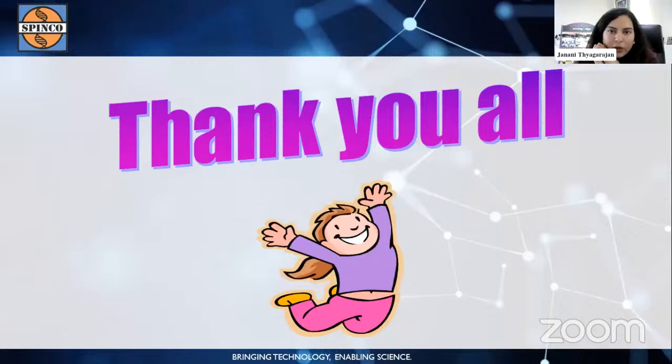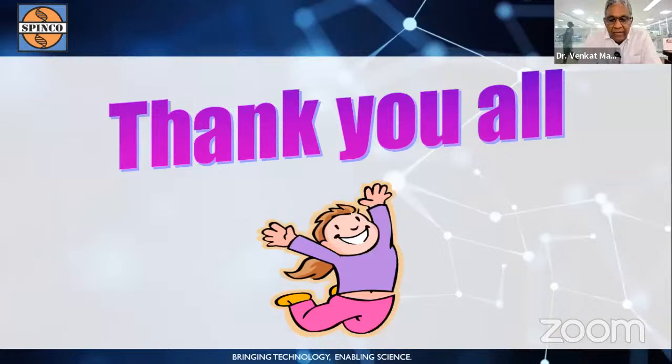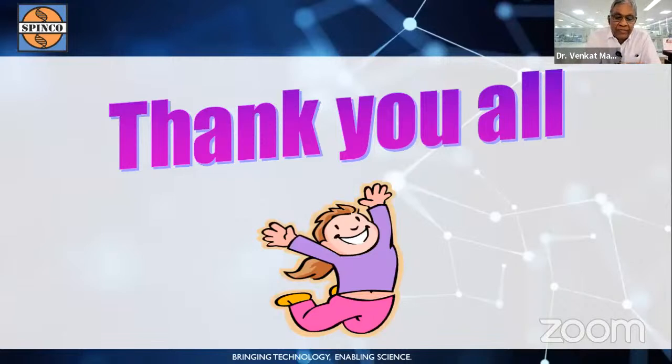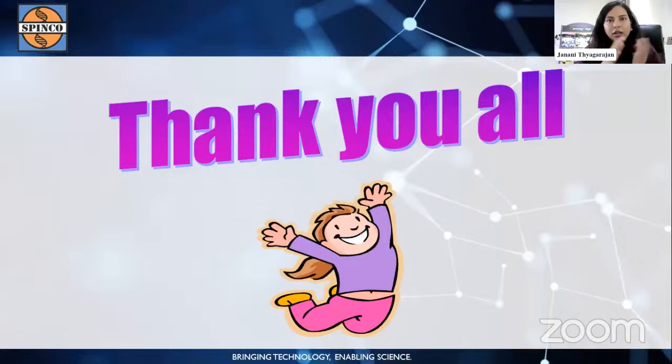Then we have one more from Nageshwar Rao, and he's asking, is the LC to MS conversion chart available? Yes, the chart is available. We'll share it in our next presentation. One more anonymous attendee asks: is triple quadrupole suitable for impurity identification and structural elucidation? Yes, suitable. That is what we were talking about, the qualitative analysis. One of the next few sessions is going to be about qualitative analysis using the LC-MS.